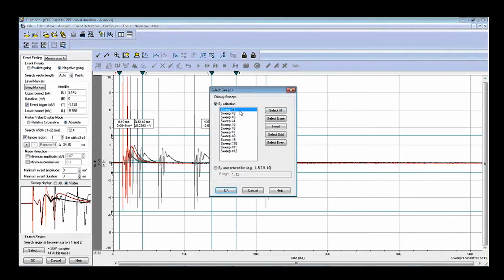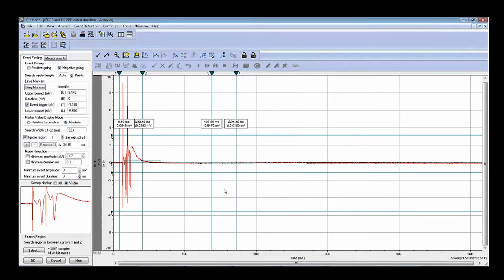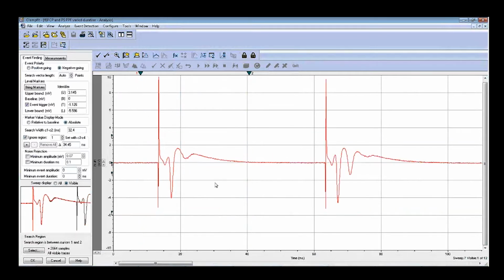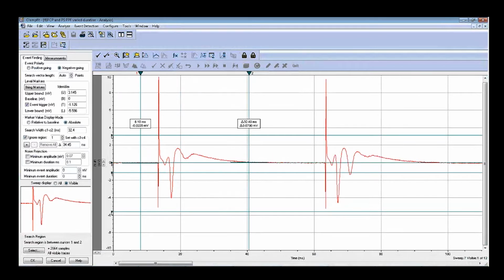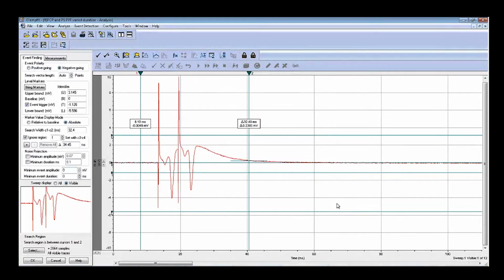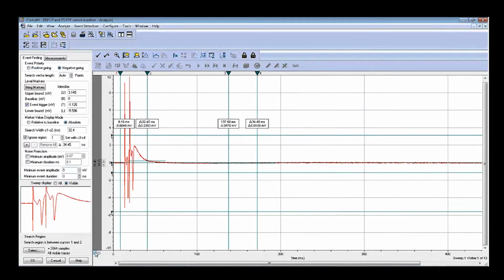Now I want to show you first what the pair pulse data looks like. Right, you can see here, and you can see the duration changes, but I just want to measure the peak of the first spike. I want to measure the ratio between the first peak and this peak. Okay, how can we do it, right? It's very tough, but we can do it.